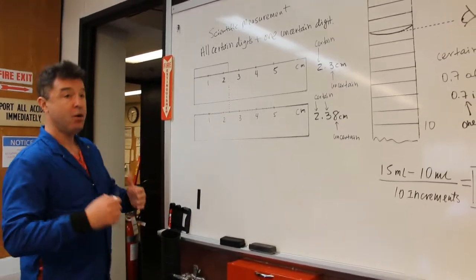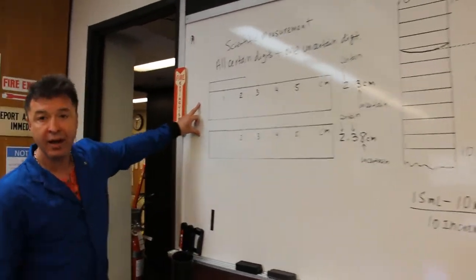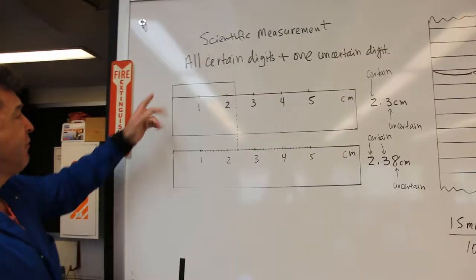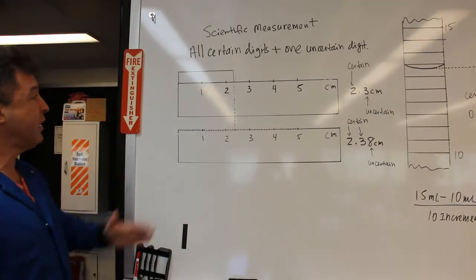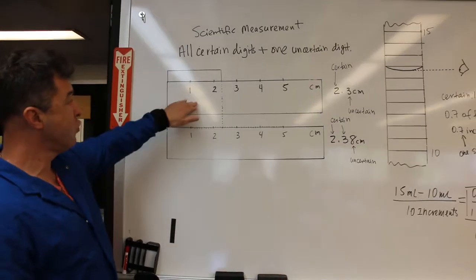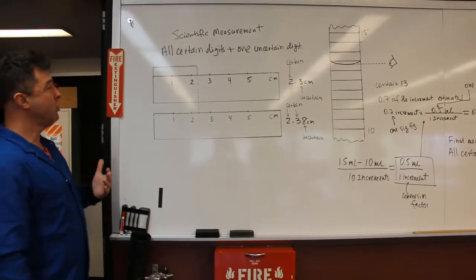So, how do I make a measurement? Well, it largely depends on the equipment that I have. Here I have these two rulers, and I have this little block that I tried to measure with these two rulers. You can see this ruler has more precision, where this ruler has less precision. So how do you take a measurement?